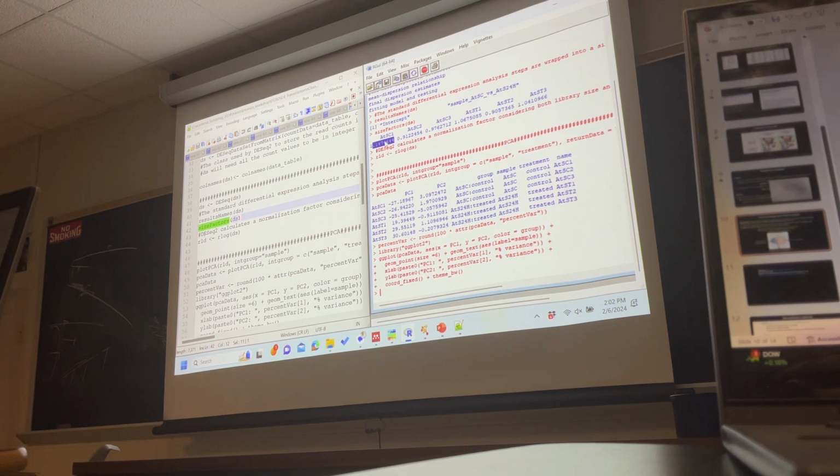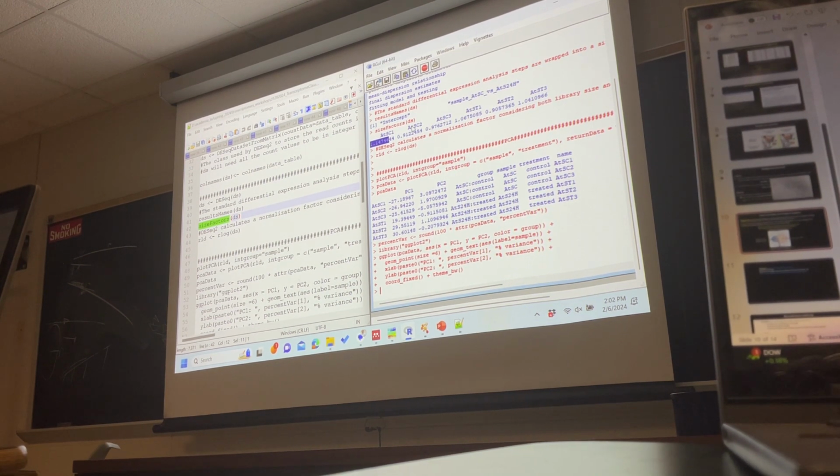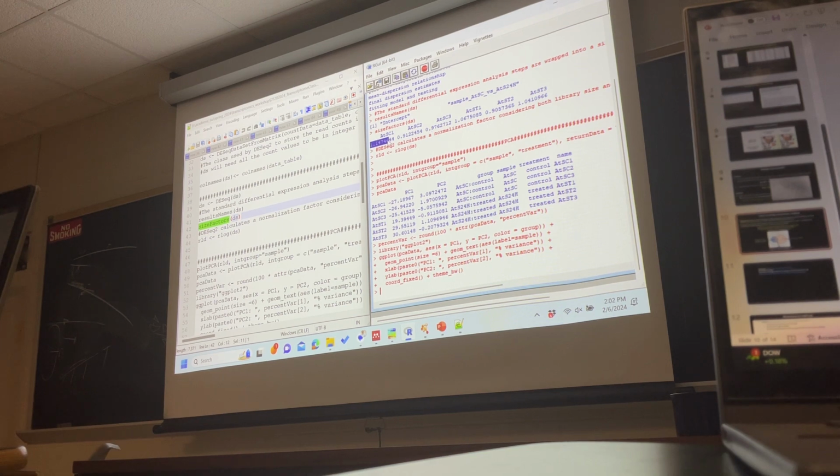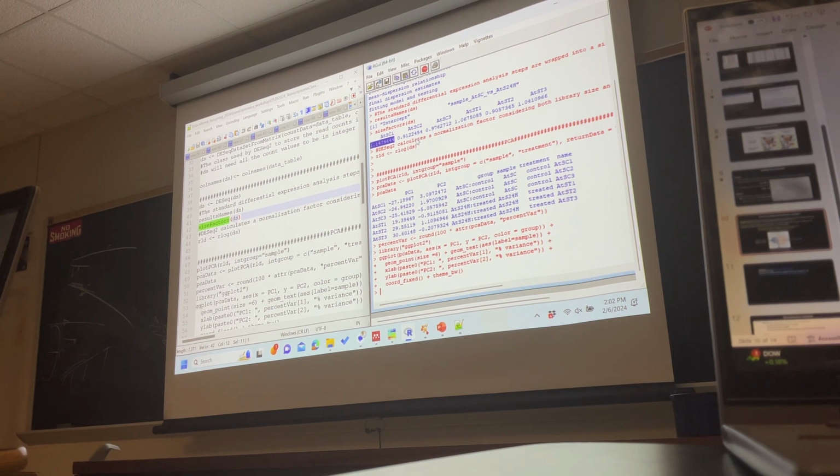This is the value for each sample, because it did all those normalizations in the background and generated a value for each sample. Now this value will be used to divide the initial raw count value of the gene expression.